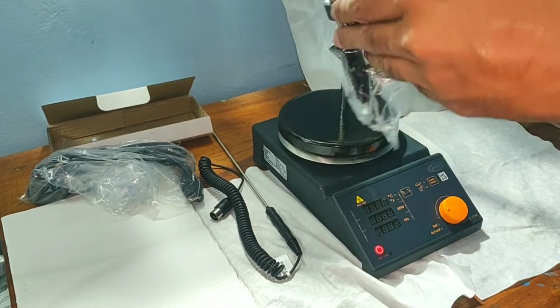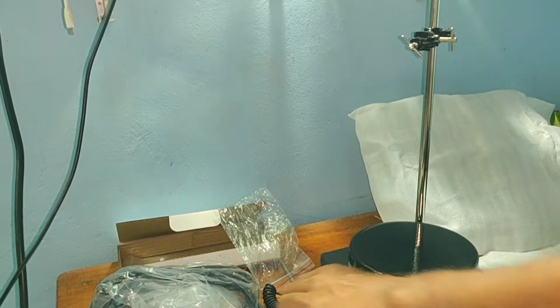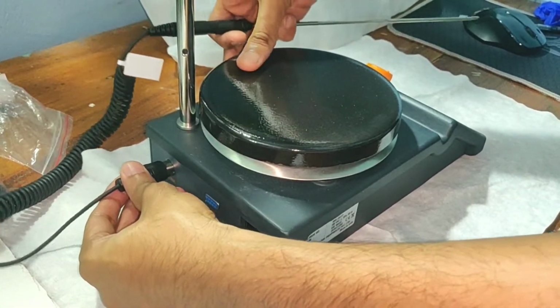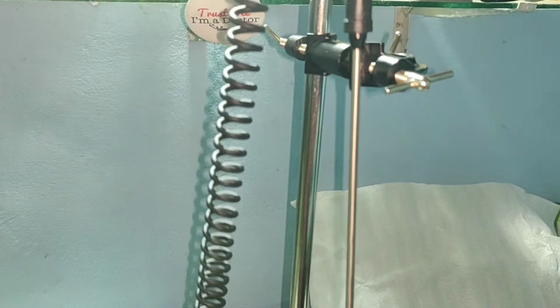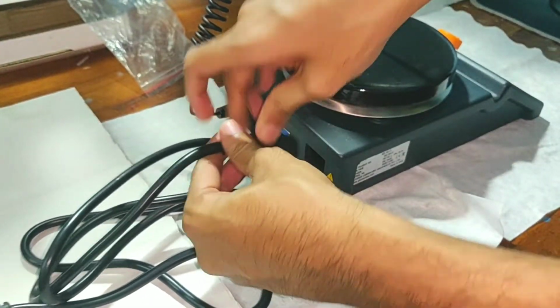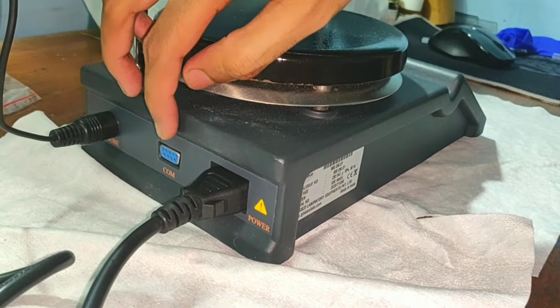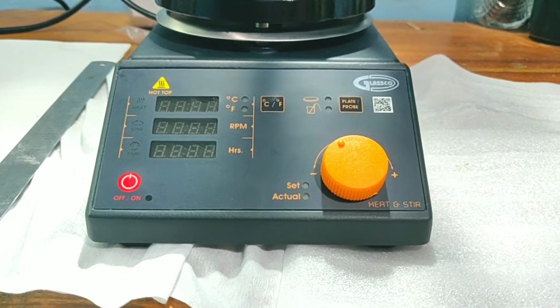Now let us attach the Boss head onto the clamp. The Boss head is also well built. And next we attach the platinum temperature sensor onto the Boss head. The wire from the platinum sensor is attached onto the port of the platinum sensor in the back of the hot plate, and the probe is fixed onto the Boss head. The power cord is attached into the port of the power cord on the back of the hot plate, and the other end is attached to a 16 ampere large socket. For the time being, let us leave the center port, which is not absolutely necessary for the functioning of the hot plate. Now coming to the front, we have our control panel.